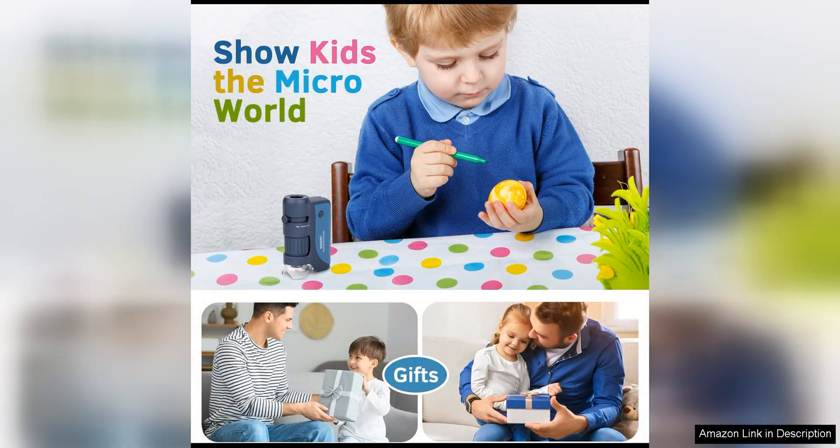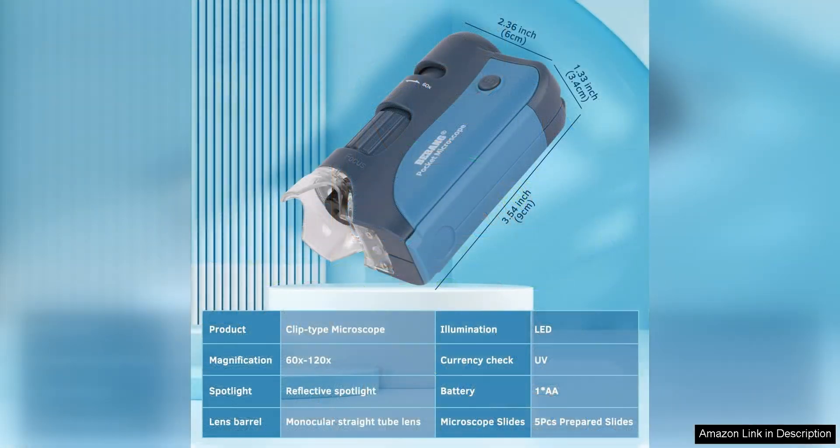The inclusion of five slides gives users a head start in their exploration. The slides feature a variety of specimens, from plant cells to insect wings, offering a diverse range of subjects to study. This is a great way to kickstart the learning process and inspire curiosity in the natural world.